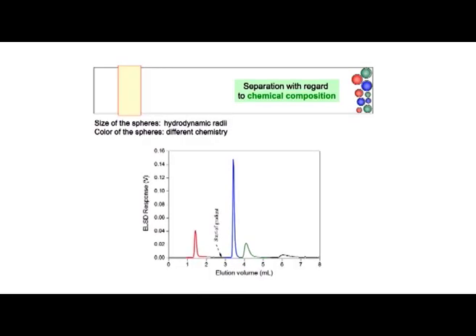As you can see, firstly the red colored balls are separated, and you get a nice separation, or an individual red peak on the chromatogram. Then next are the blue colored dots, separated according to their chemical nature, and as I explained before, there is a slight dependence on the molar mass. Other than that, we have a nice separation of the individual components in the HPLC chromatogram.